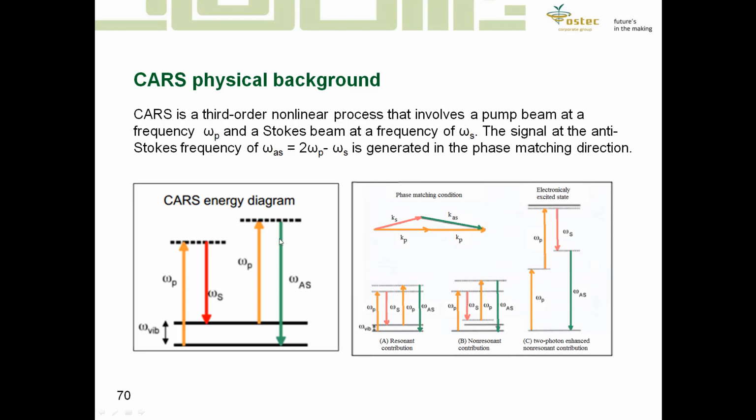And in this case, the anti-Stokes photons are emitted at a higher energy than the excitation energies and with a very high intensity.